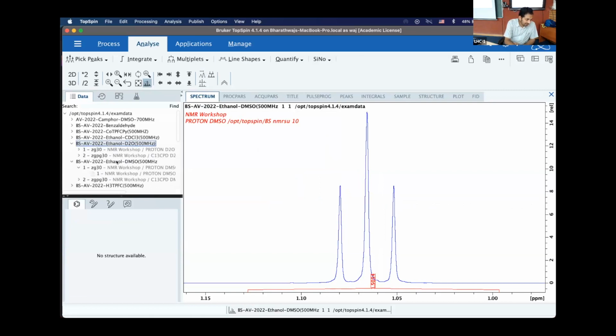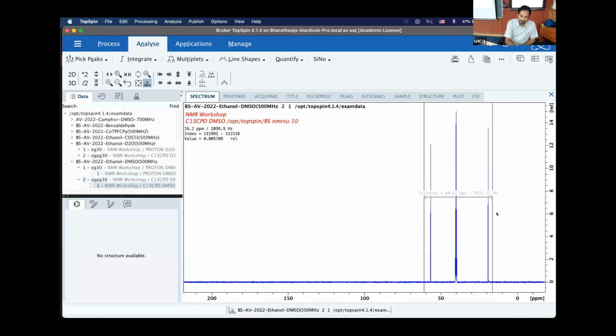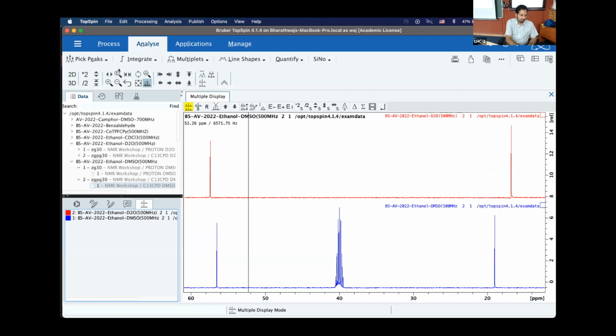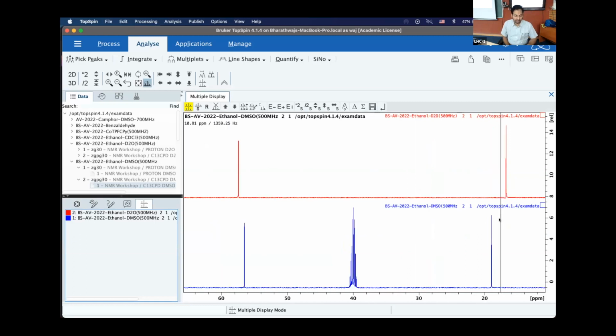On the other hand, let's also ask whether the carbon NMR changed. Let's say we take the carbon NMR. Okay, there you go. First question for all of you. Be prepared. Look at the major difference between carbon NMR acquired for ethanol. The bottom blue trace is for carbon NMR for ethanol in DMSO D6. And the top trace is for carbon NMR for ethanol acquired in D2O. What is the first major difference you guys see? Extra peak. What is that extra peak?